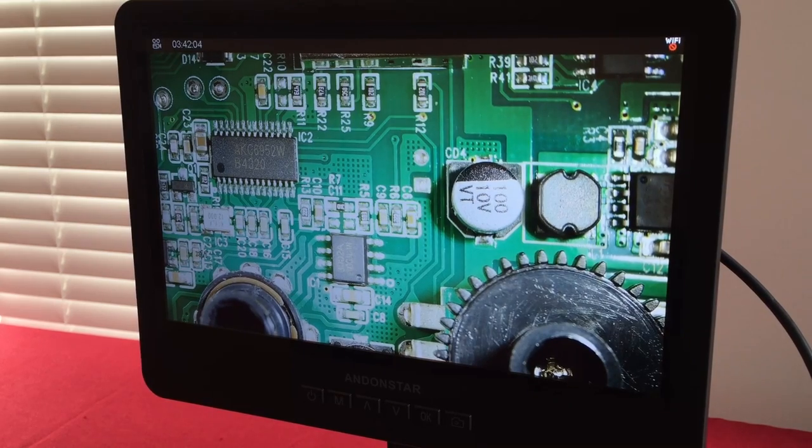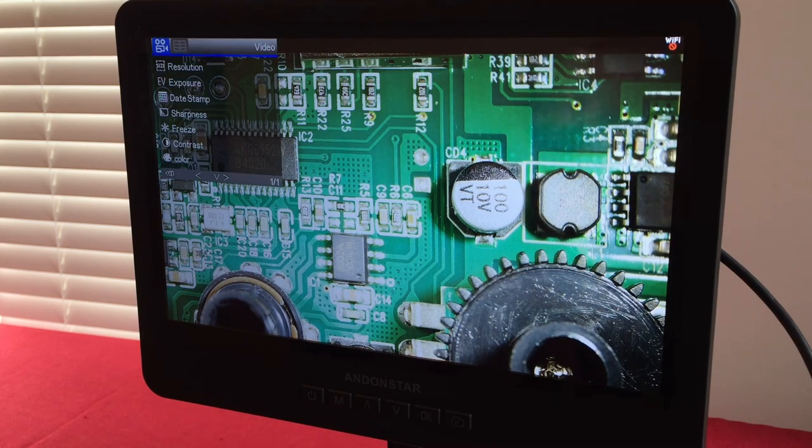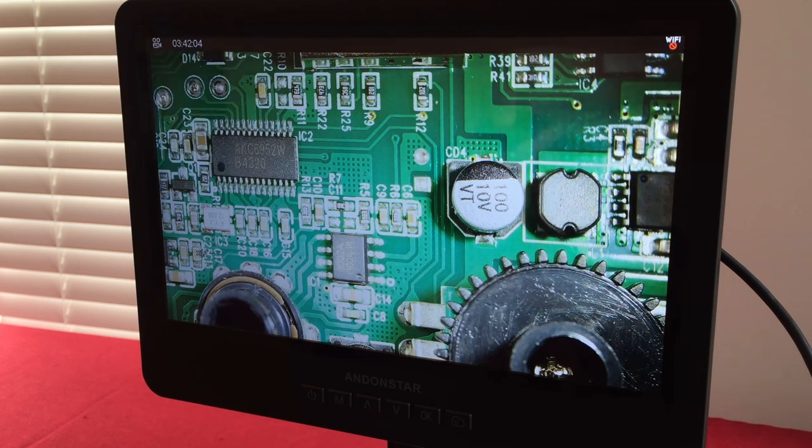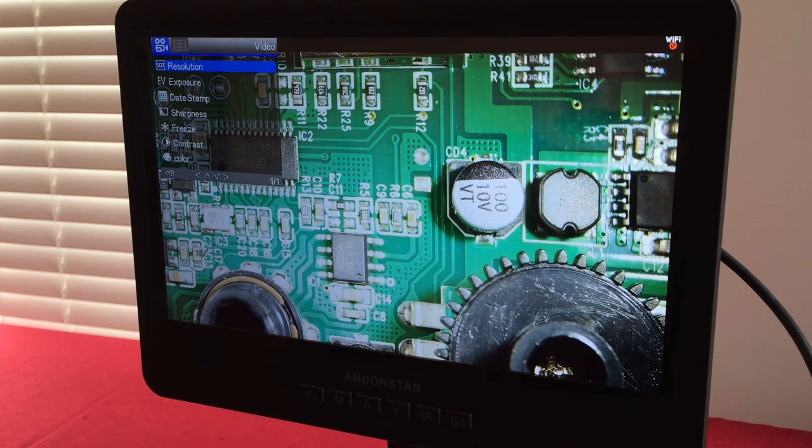Going into the menu for playback: resolution options include HD at 30 frames, HD at 60 frames, HD at 120 frames, full HD progressive at 30 frames, full HD at 60 frames, QHD at 30 frames, and ultra high definition progressive at 24 frames a second. There are also exposure settings you can adjust.